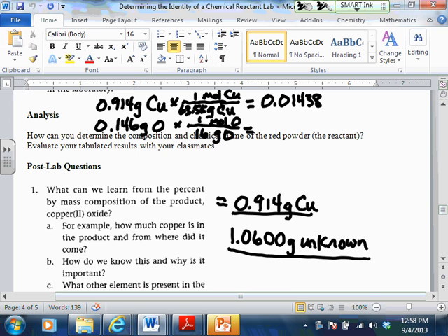0.146 divided by 16 is 0.009125. Okay, so our smallest number is the bottom one here. This is already boding well for us, but let's see. Okay, not bad. 1.58. In a lab setting, we can round that up to 2, right?